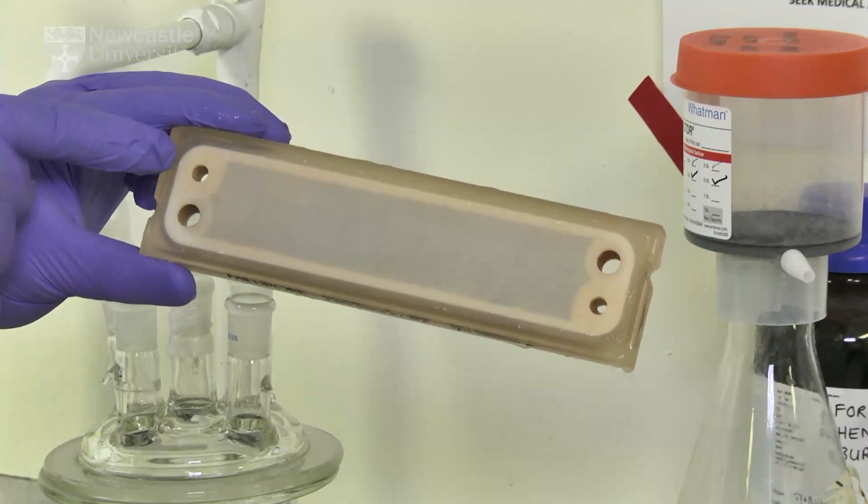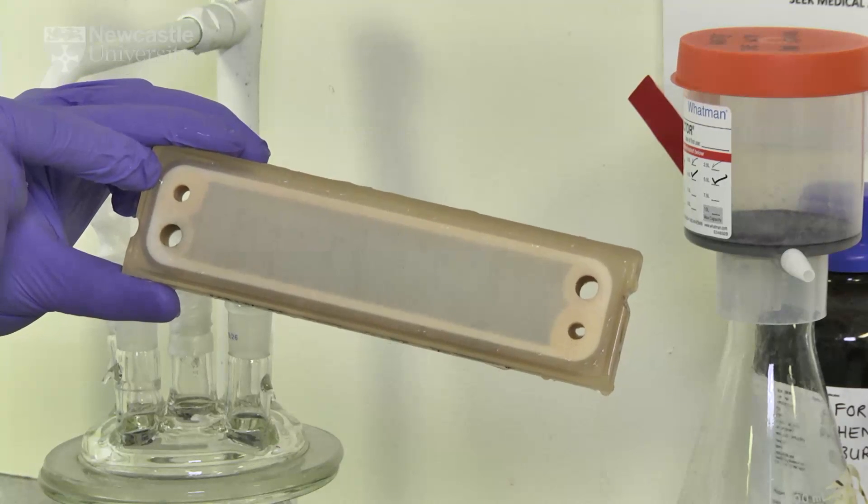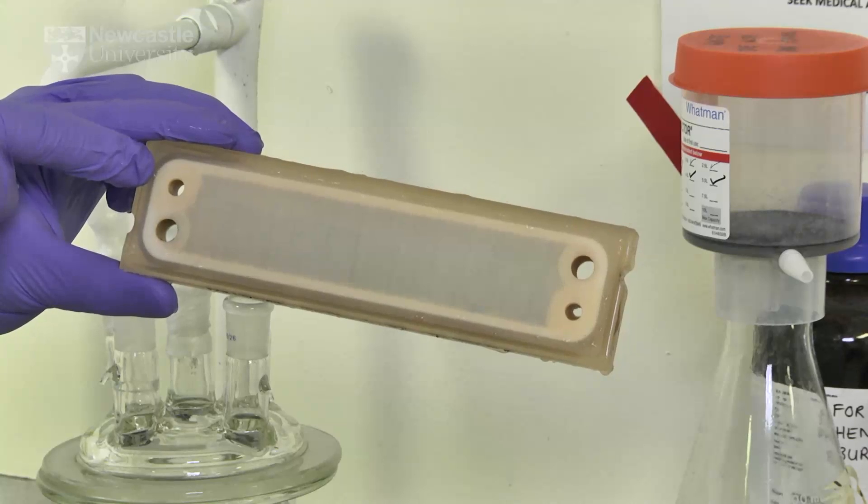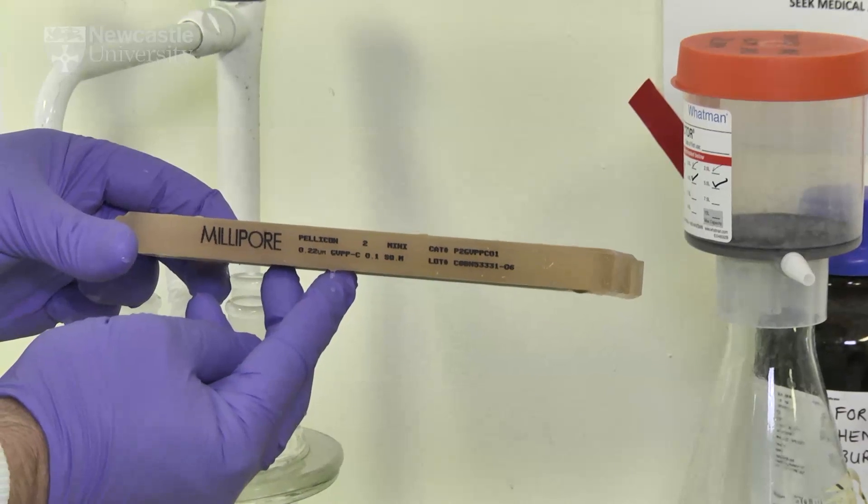This exit indicated here allows the permeate pressure to be measured with the addition of a pressure gauge. These Millipore cassettes have a surface area of 0.1m² and a nominal pore size of 0.22 micrometres.